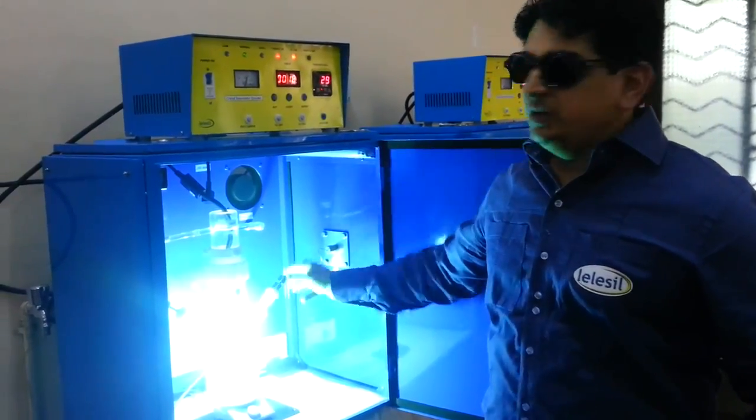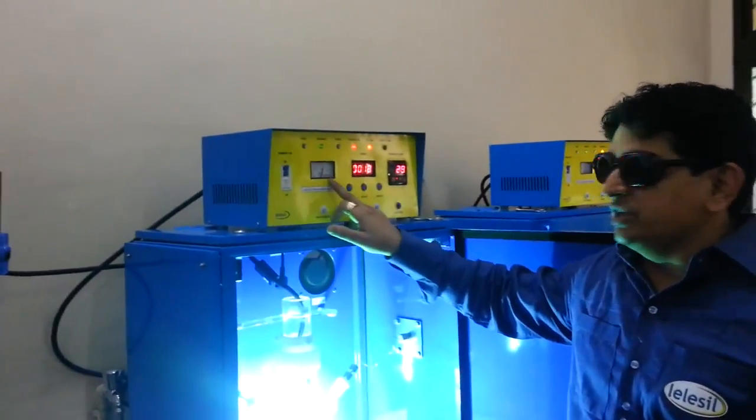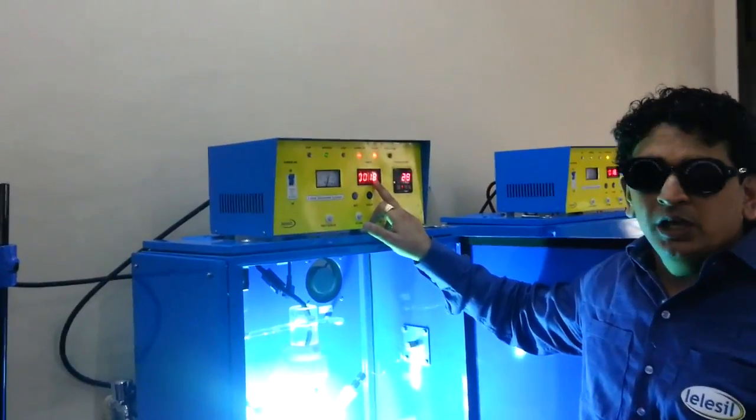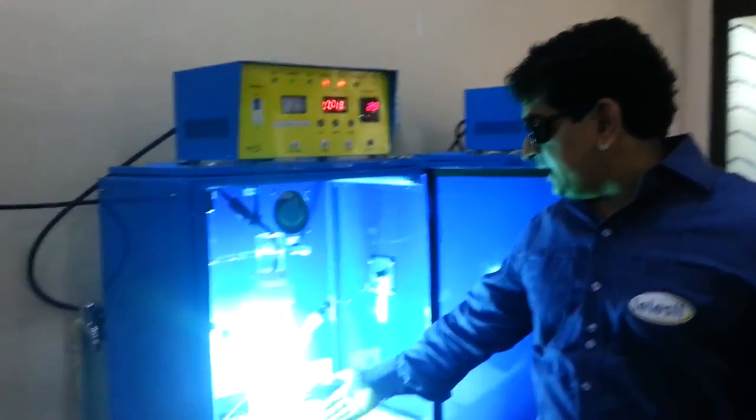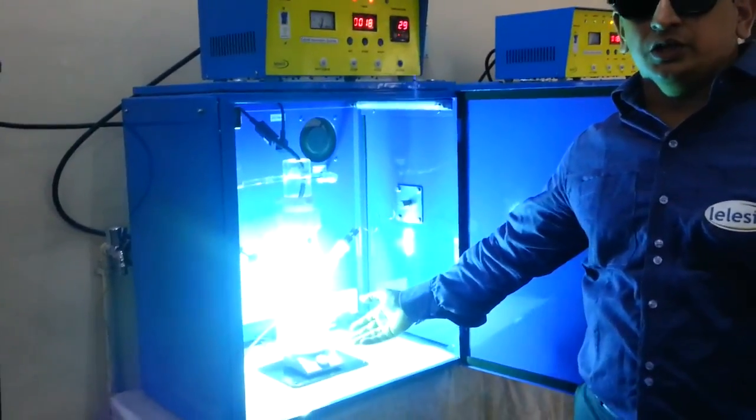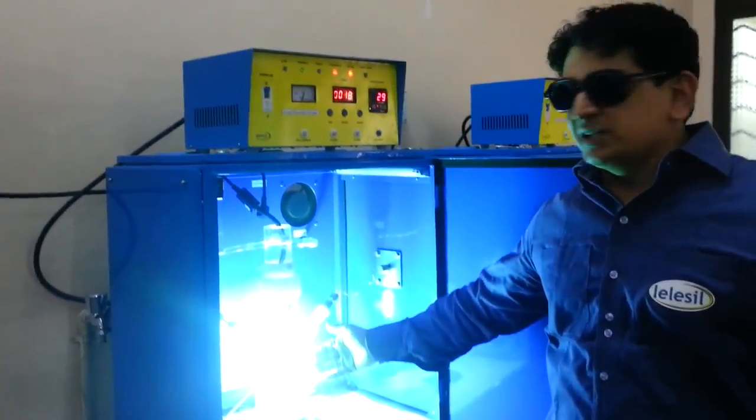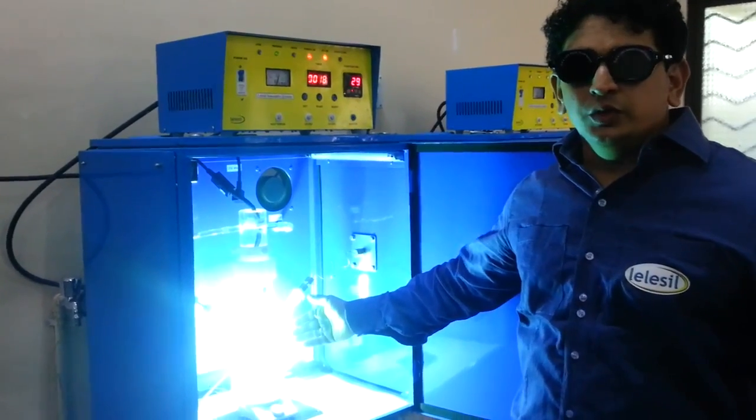This is the controller system. You see voltage here, you see the timer for exposure of UV lamp, you see the temperature of the system, you see a magnet externally stirring the liquid continuously. What you see inside is a 450 watt UV lamp.